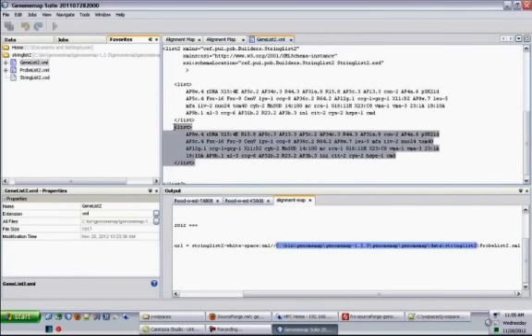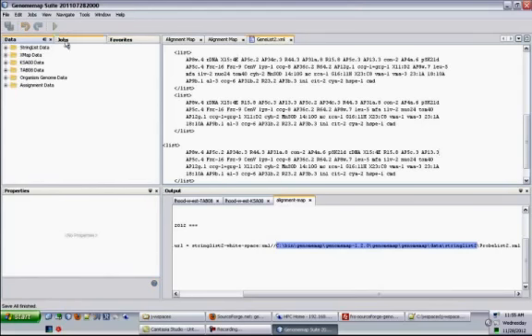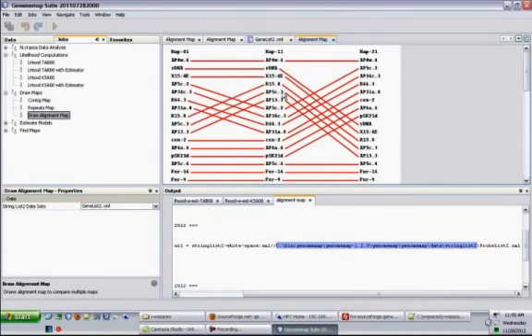For example, let's add another map here, and let's change some ordering. Save the file. So now the dataset is modified. Gene list 2. So we see that now we have 3 maps.